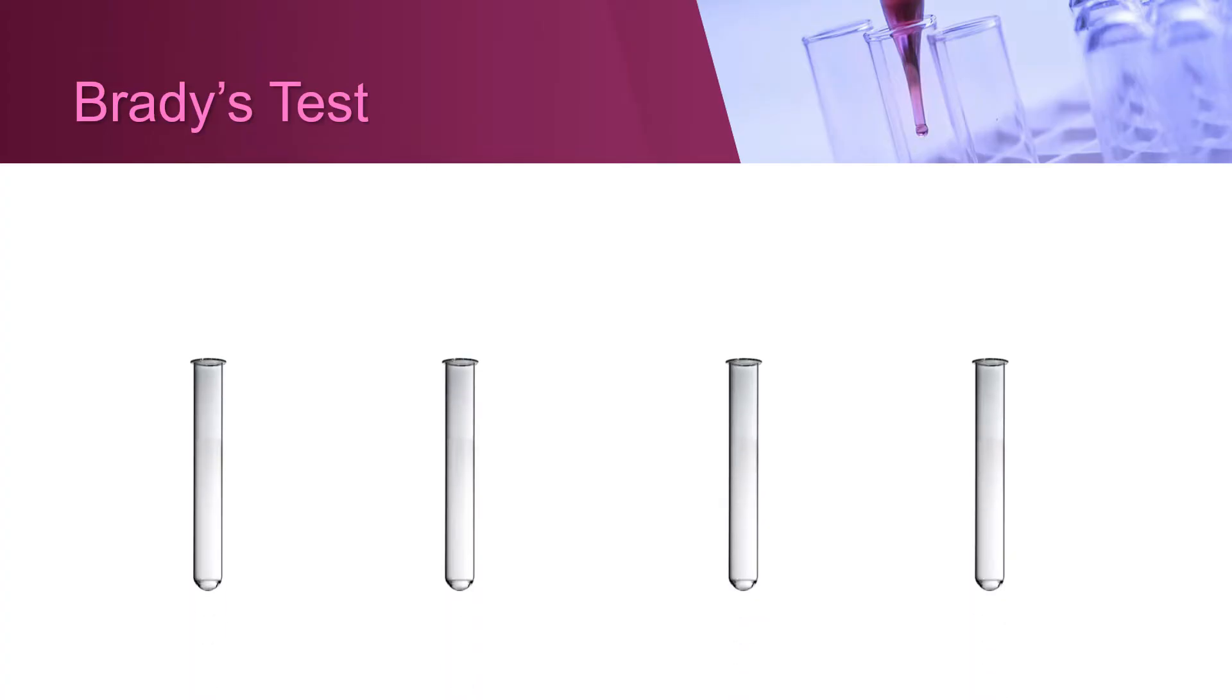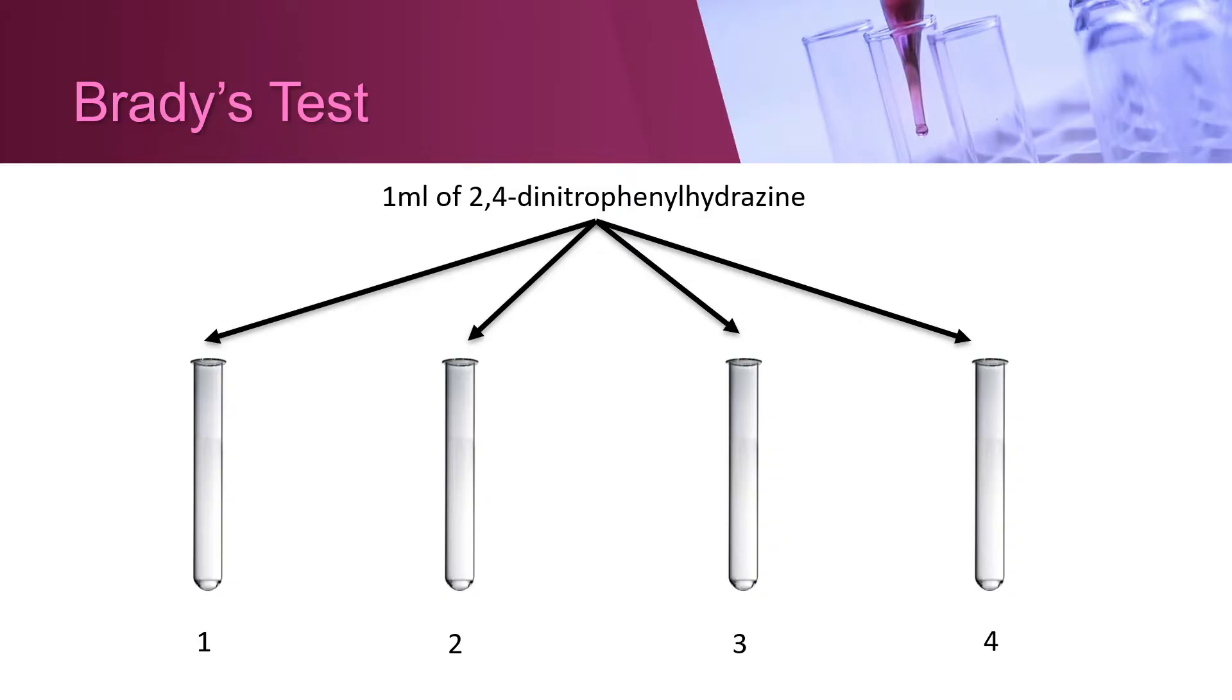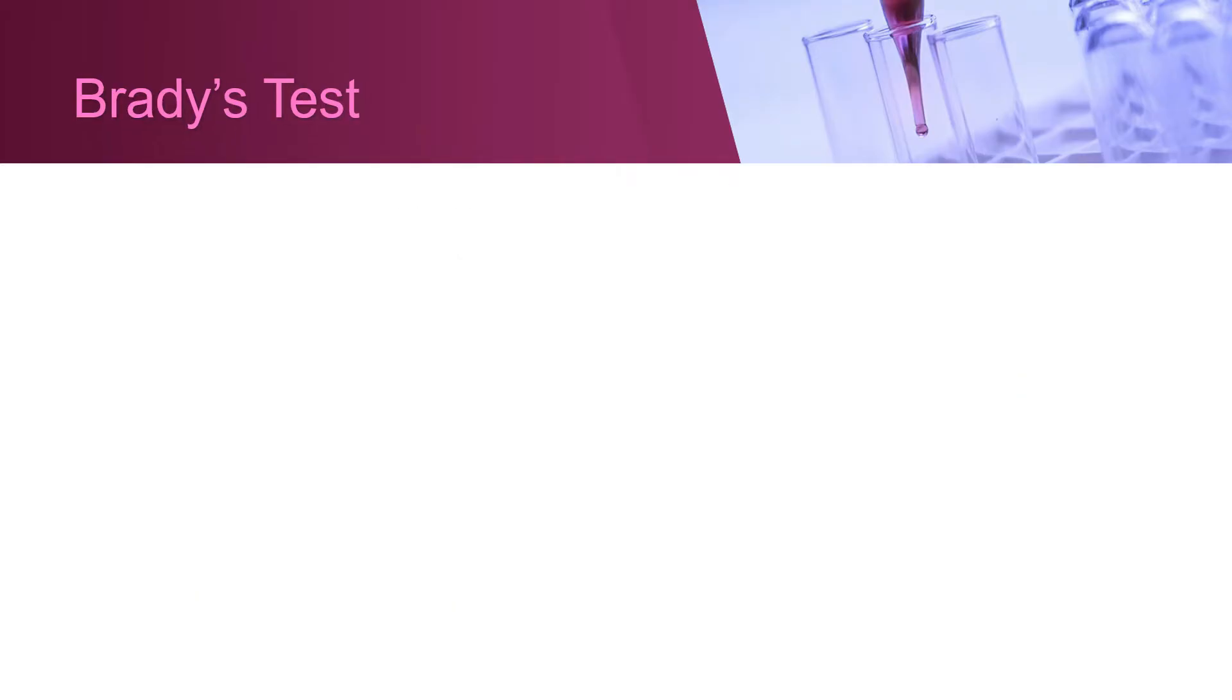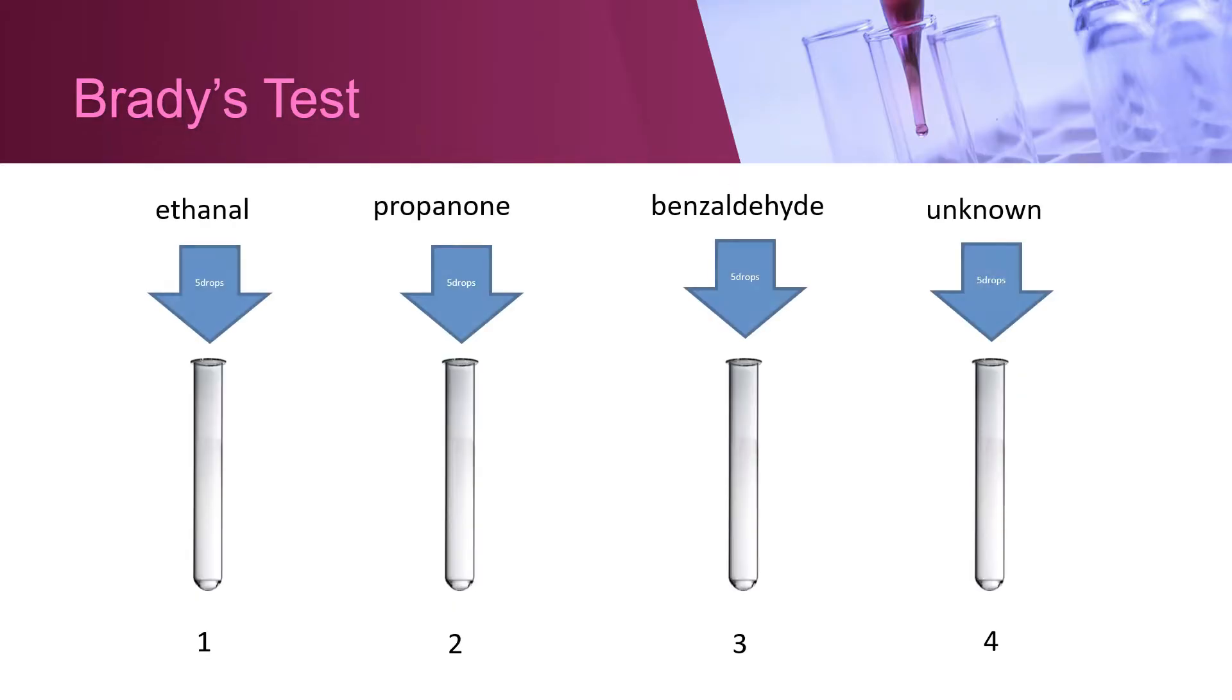Brady's test: Place approximately 1 milliliter of 2,4-dinitrophenylhydrazine into a test tube. Add 5 drops of ethanol, propanone, benzaldehyde, and unknown.